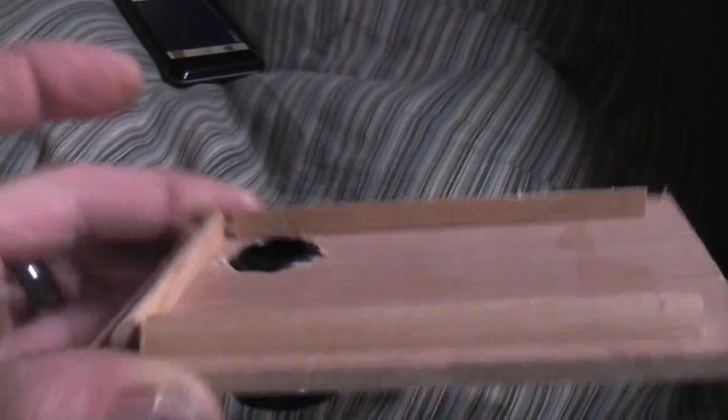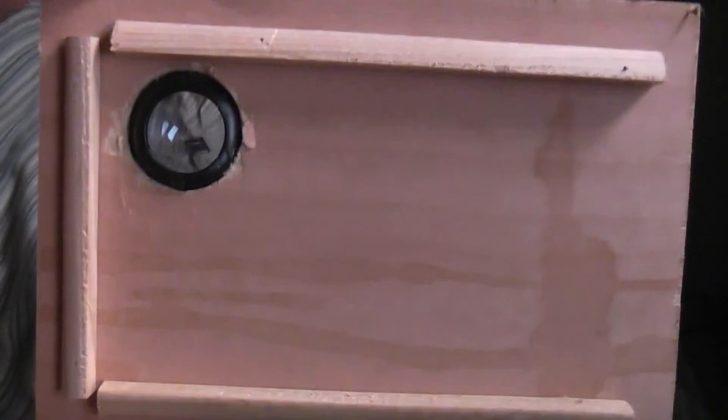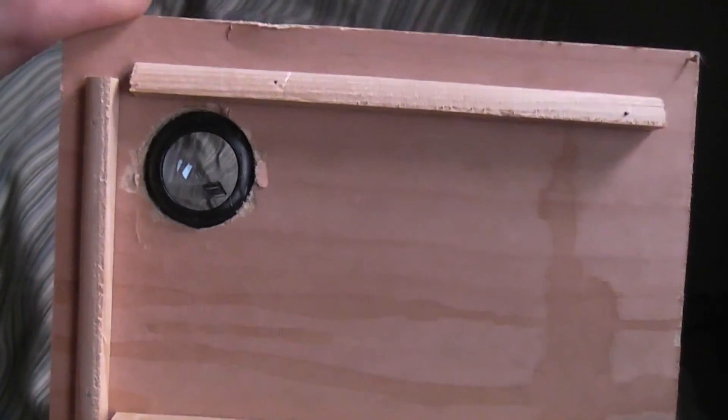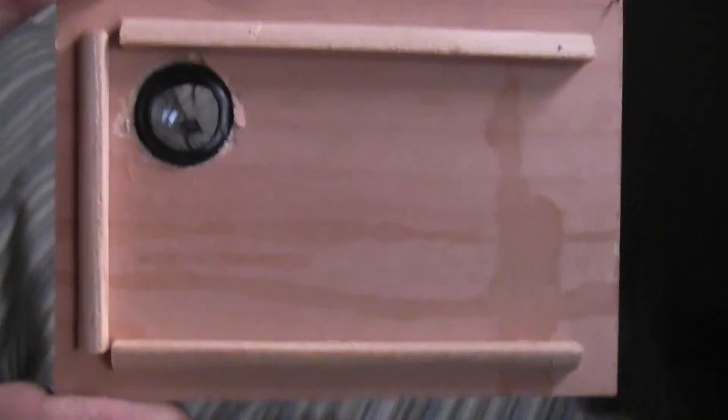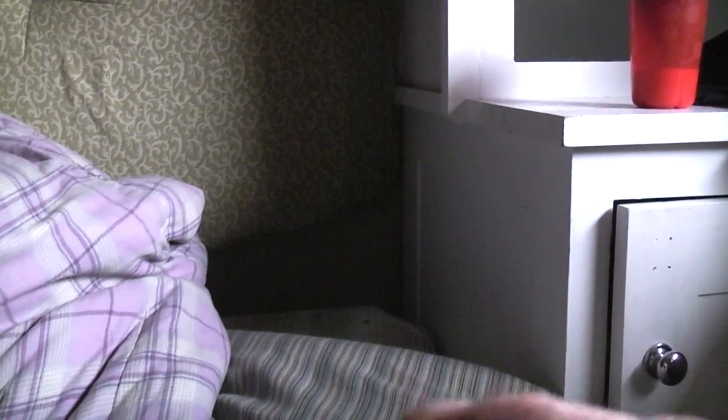So all this is is a lens mounted on a piece of quarter inch plywood with a few pieces to hold my phone in. And I'll show you how it works, because this thing is so easy.